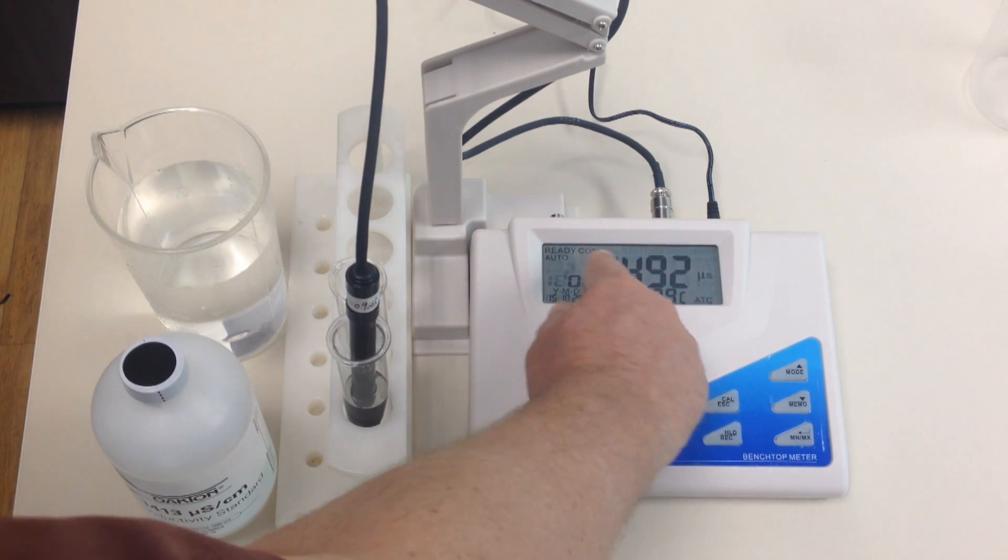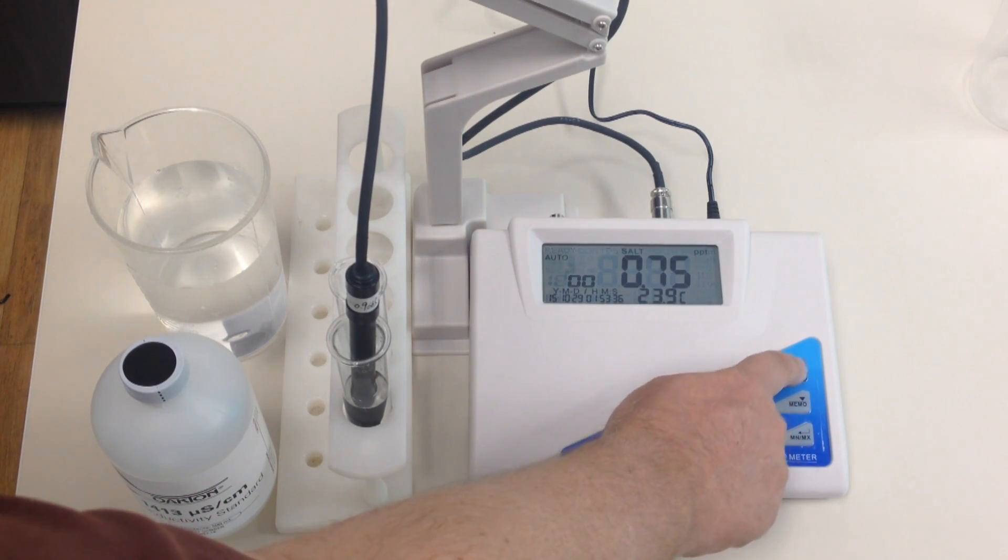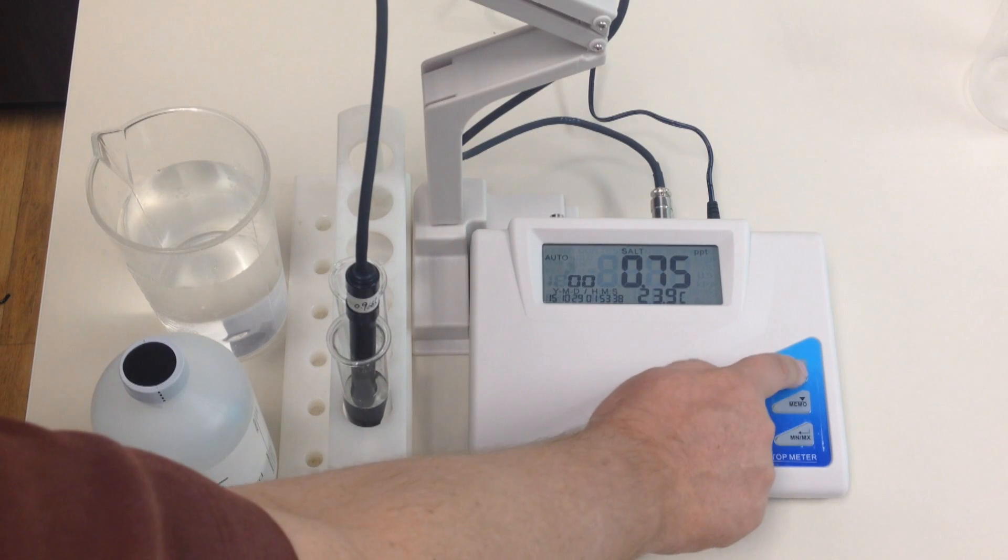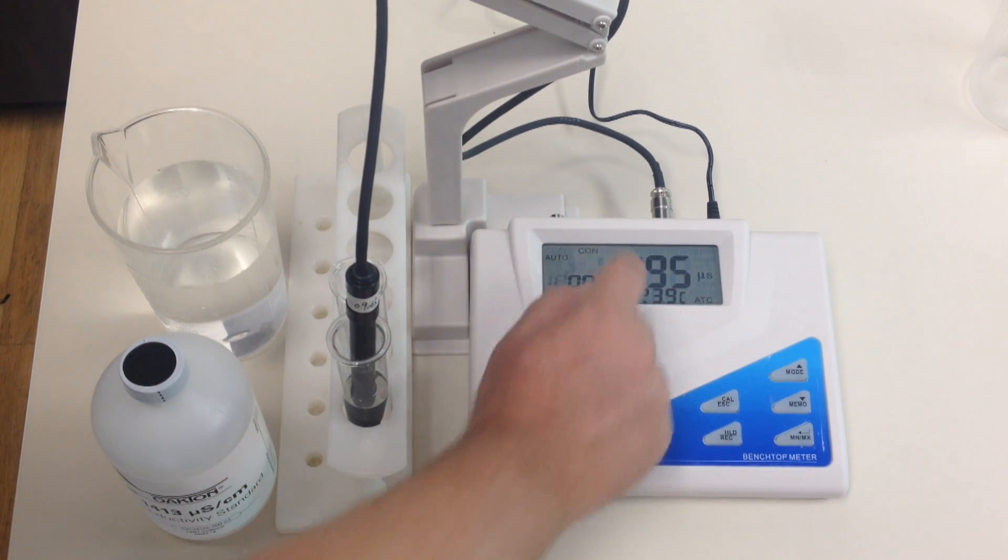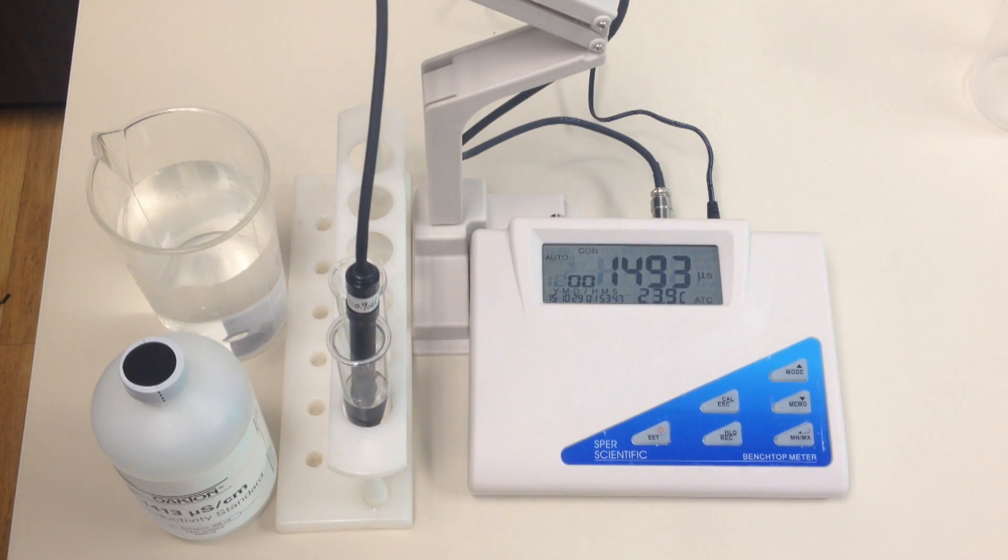But let's say it was in a different one, such as pH or salt. You would just use the mode button, as you can see I'm hitting the mode button, and moving across until I came back to conductivity. So that's the first step, you want to make sure you're in the right mode.